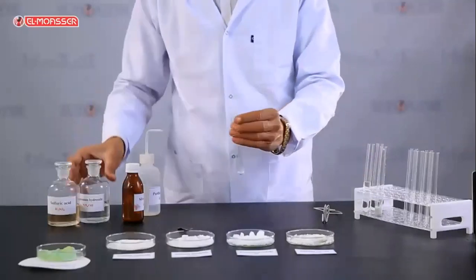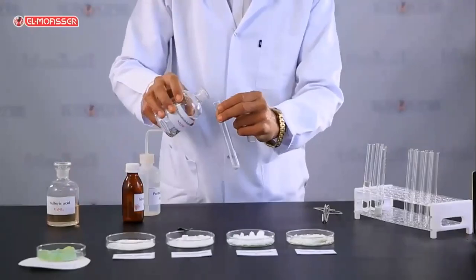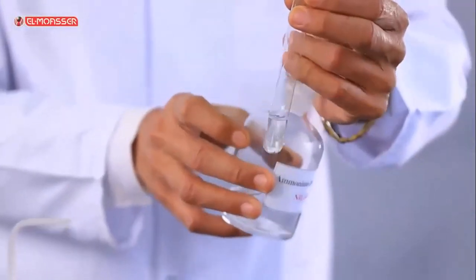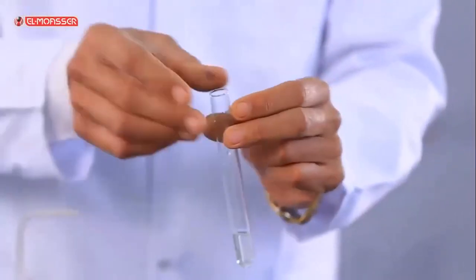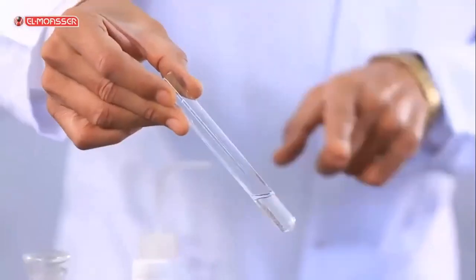Add a concentrated ammonia solution to the precipitate. What do you observe? The precipitate slowly dissolves in the concentrated ammonia solution.